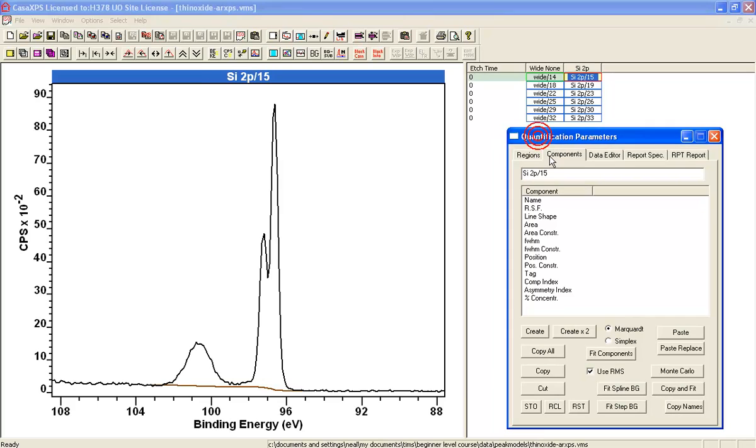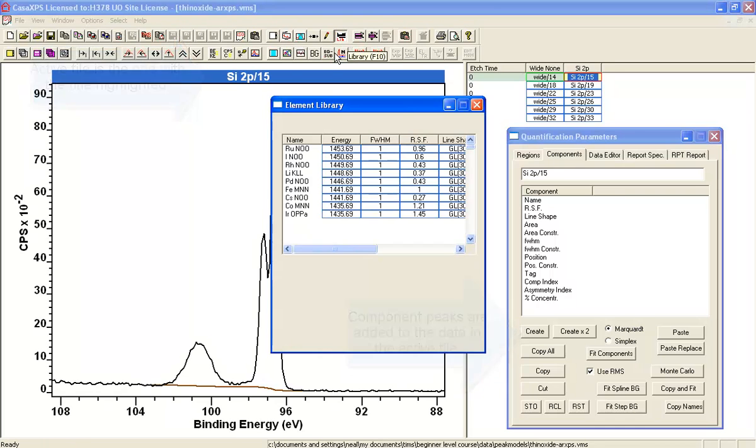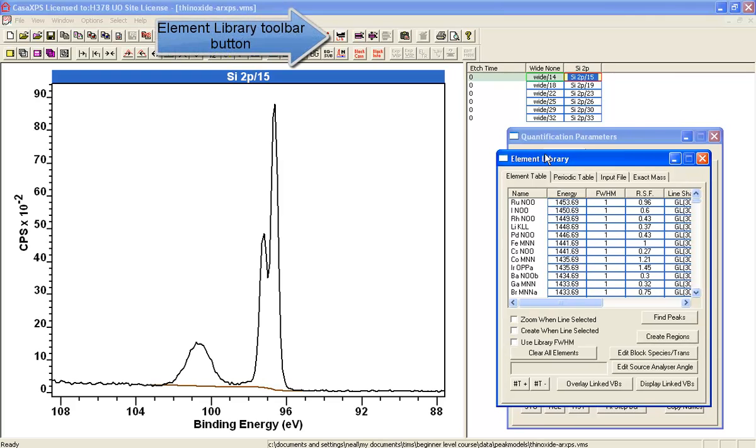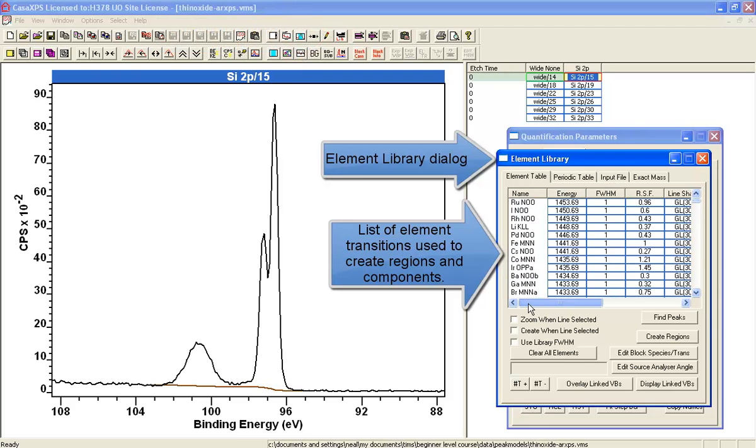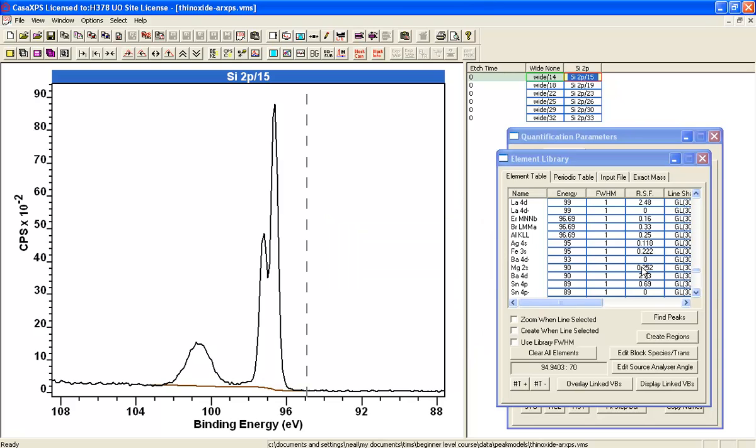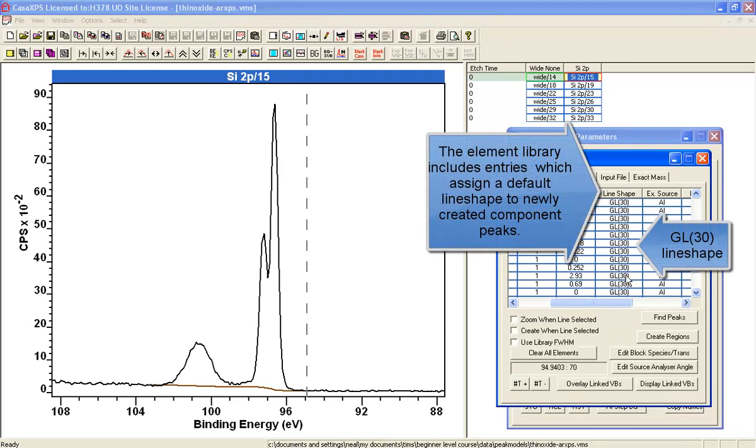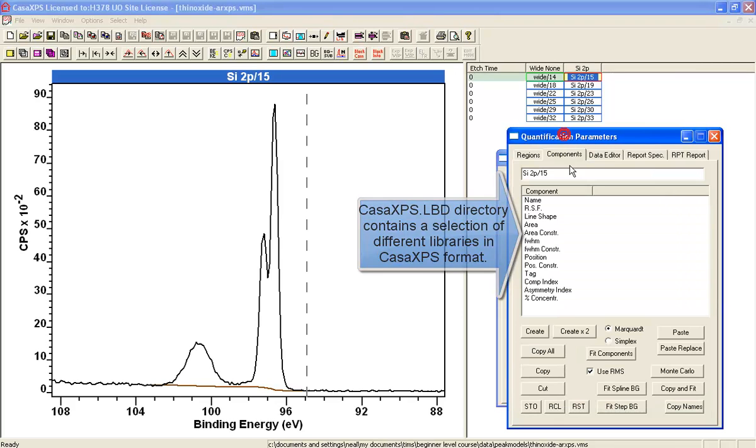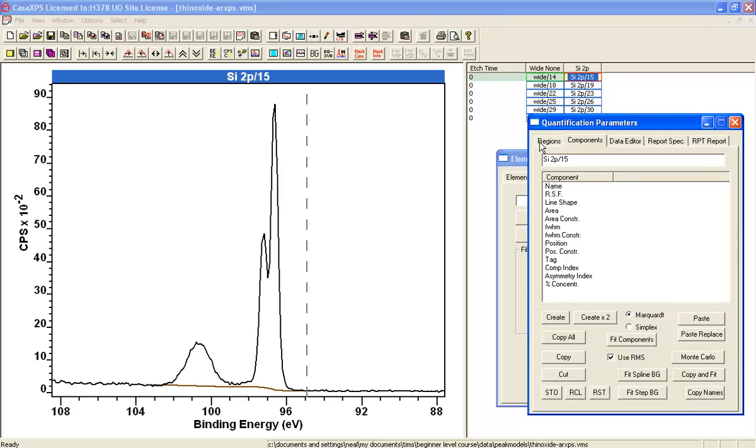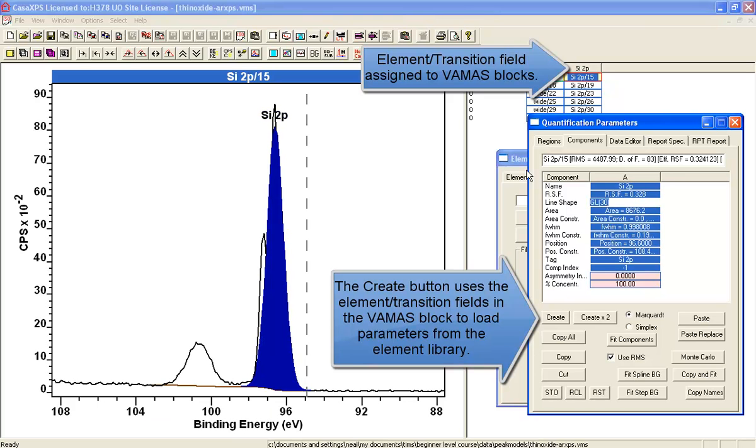We create these component peaks on the component property page, and before we start creating these peaks what we'll do is we'll load a library that will give us line shapes that are different from the default library. The default library has come in and it is a Kratos library, so these RSFs correspond to a Kratos axis instrument which corresponds to these data which were acquired on a Kratos system. The line shape in this library, they're all set to GL30, and just to illustrate that these can be changed, well first of all the consequence of having a GL30 in the element library is that when I create a peak, the GL30 comes in here and that's because it was in the element library.